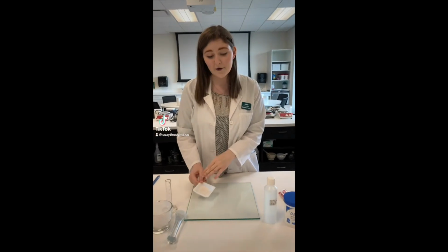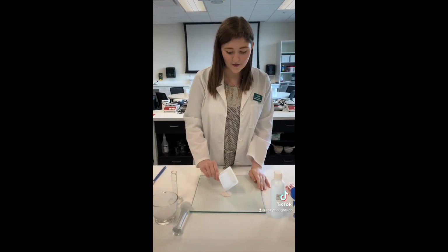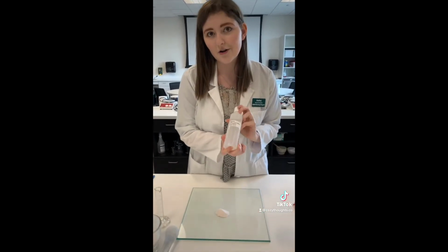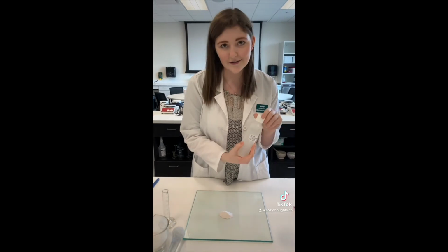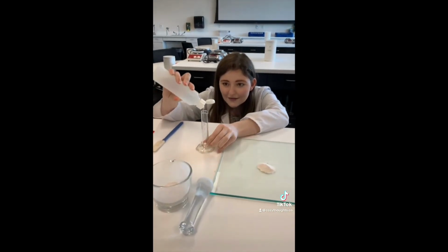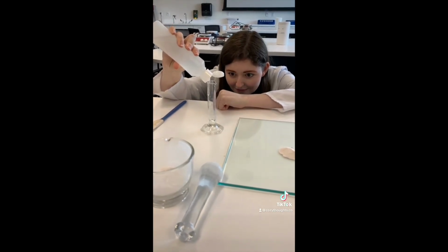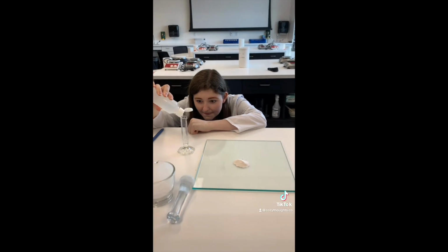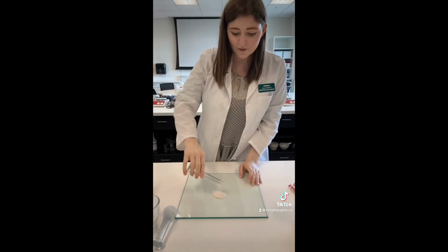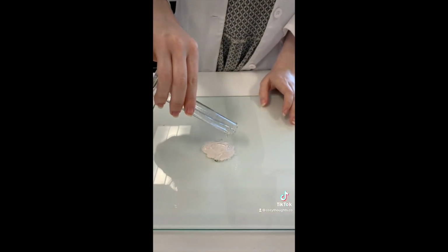Now I'm putting this powder on what's called an ointment slab in order to try to make this into an ointment. So the first thing that we have to do is measure out what's called our levigating agent. This is glycerin, and I'm going to get just about 5 mLs of it. There we go. I'm just going to pour it right over, like I'm putting gravy on mashed potatoes.